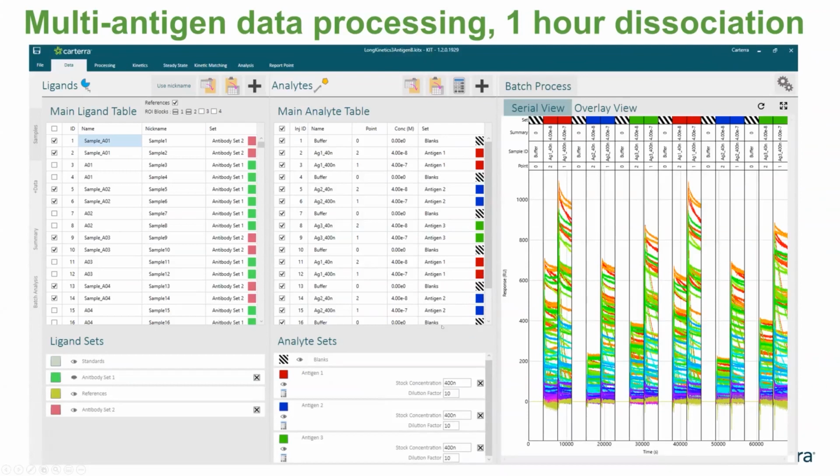And so we were doing one injection at 400 nanomolar and then a 10-fold dilution to do another injection at 40 nanomolar. So usually, as in the previous example, we recommend doing large dilution series covering a broad kinetic range, because the main focus of this analysis was on off rate. We chose to do replicates of 2 concentrations, and we had 3 antigens. So this was about a 24-hour run just with these injections. That was about the most time we had for this experiment.